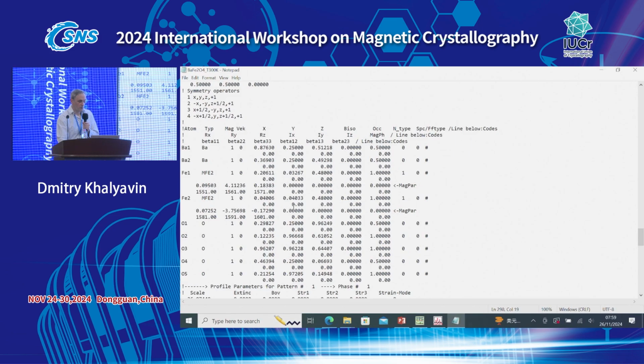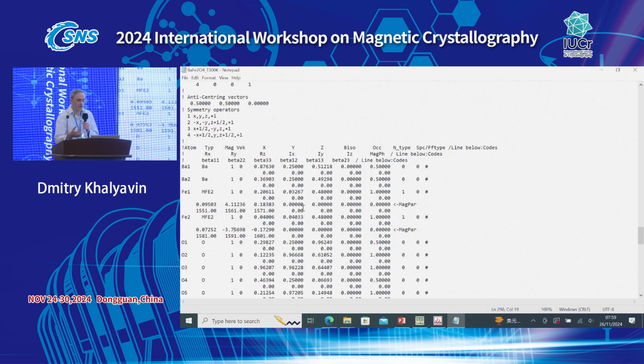So what we can refine now, we can start refining structural parameters as well, because so far we keep them like they were refined for 1000 Kelvin, even above that. So they're probably not good. And what is definitely wrong are the thermal parameters here, because they're just set to 0 when we were converting MSIF to PCR. So let's give the thermal parameters some finite values like 0.5. They're reasonable.